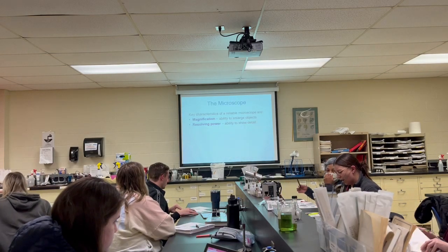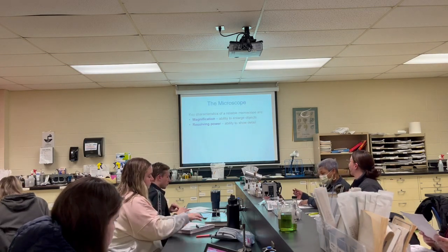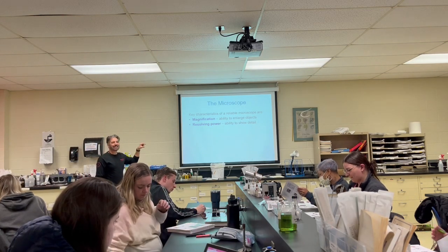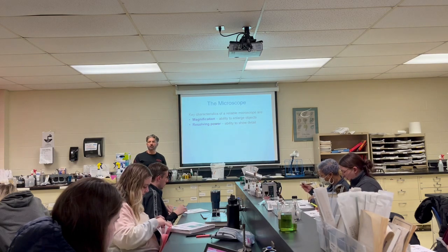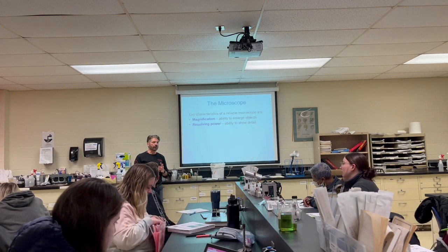Alright, so I'm gonna go over some just real basic things about the microscope. We'll go into a little bit more detail in lab. I'll actually pull out microscopes, and we'll go over all the parts. I'm hoping you are semi-familiar with the microscope. If not, we'll review it.